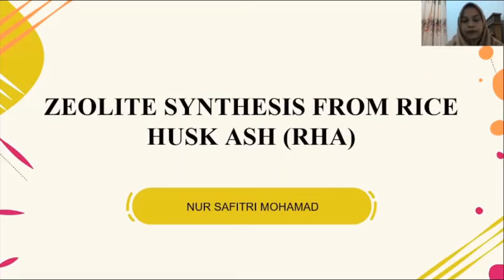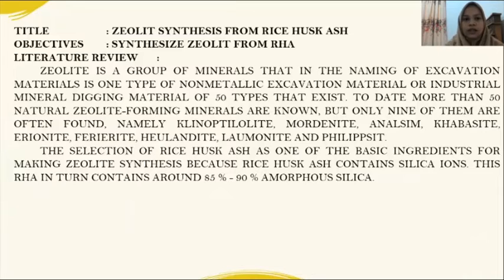I'm Nur Safitri Muhammad, a student majoring in chemistry, State University of Gorontalo. On this occasion, I will present the result of the practicum that I have done. My practicum this time is entitled Zeolite Synthesis from Rice Husk. Title: Zeolite Synthesis from Rice Husk. Objectives: Synthesize zeolite from RHA.